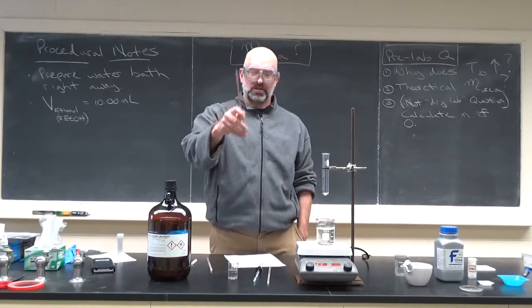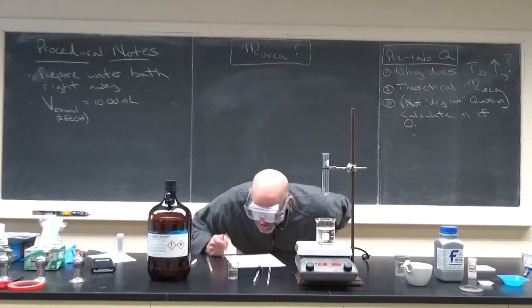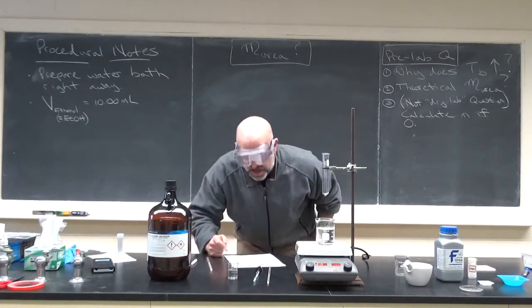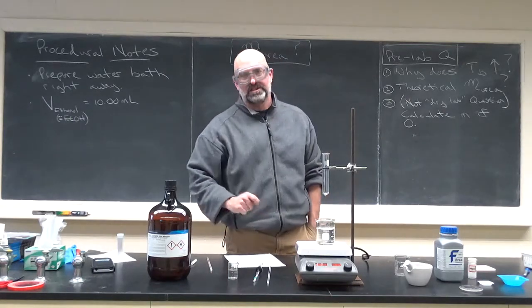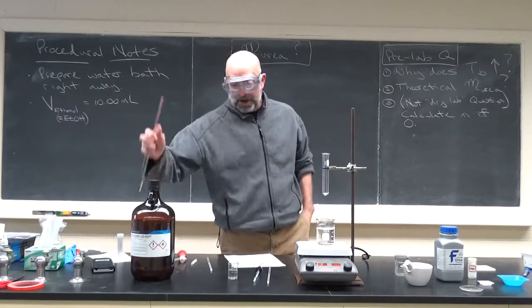Only need 10 mils, so don't waste it. And I actually probably added too much here. I added, well, the beaker's terrible, but I put about 25 mils in there, so that's being a little wasteful on my part. Okay, pipetting.